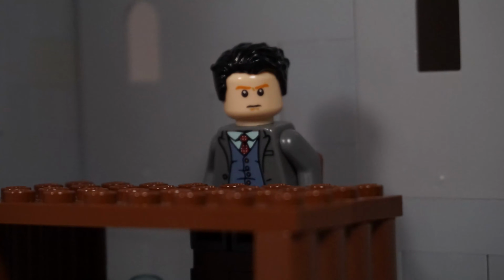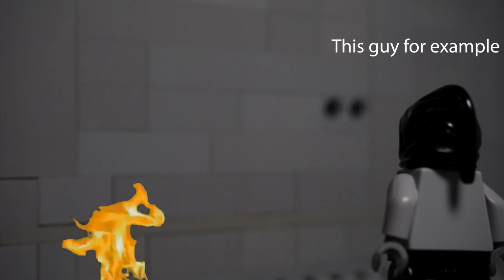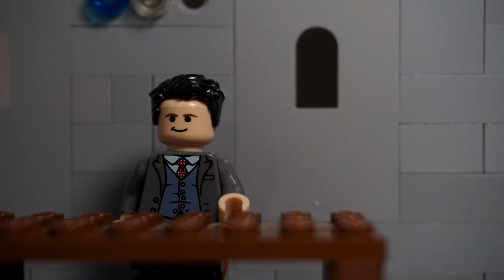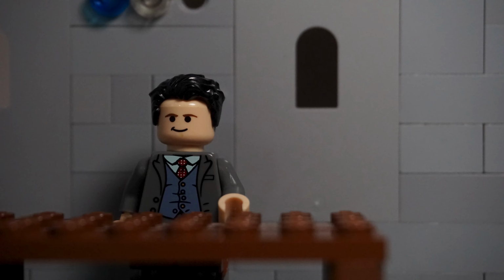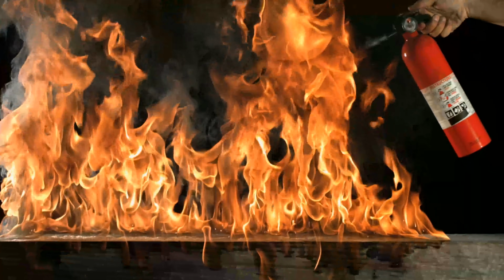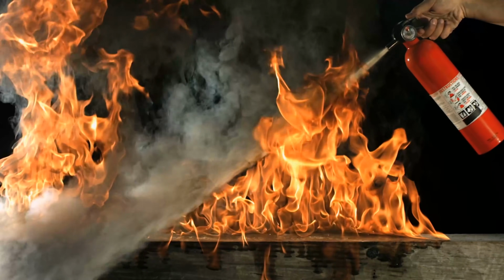There are a few things you should note about fire in this classroom. It can happen. A common way of this happening is through somebody not being careful with a gas burner. That is why it's always important to make sure that anything flammable is used carefully. Depending on the size of the fire, there are different ways to extinguish it. For a very small fire, covering it with the beaker should extinguish it, as it will deprive the fire of oxygen. Some other ways are by using a fire blanket, which smothers the fire when it is small. Another is the fire extinguisher. The fire extinguisher is reserved for large fires. After using it, return to the stockroom so that it can be refilled.